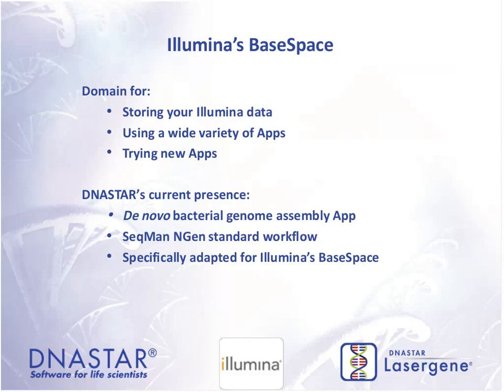over to BaseSpace, and then you have access to a number of applications there. And it's a growing list, and more people have been using these applications, and you can try them out and see how they work for you. Some are free, some you have to pay to use.